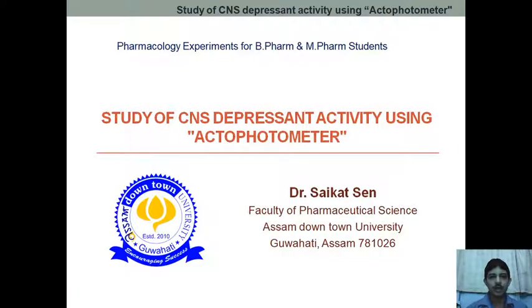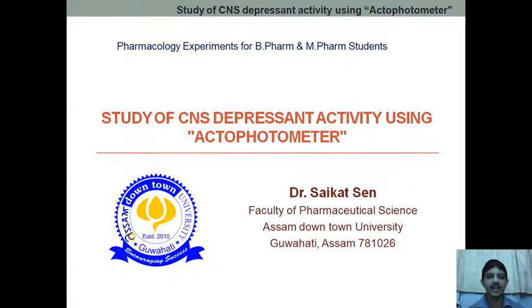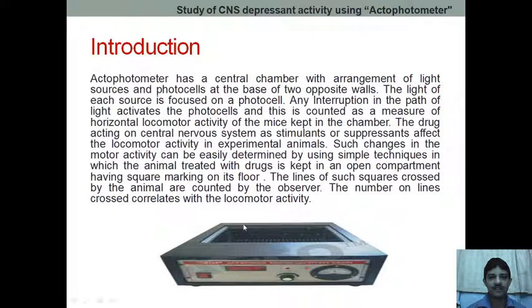Good morning. In our next practical we are going to evaluate CNS depressant activity. The experiment is the study of CNS depressant activity using the actophotometer. This is the instrument as we have previously seen, known as the actophotometer.